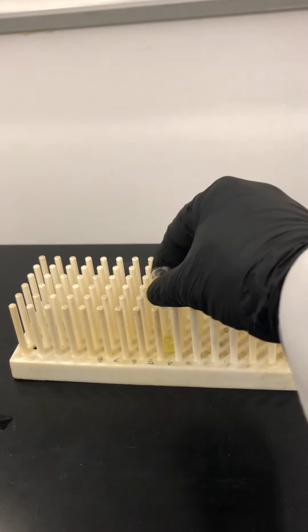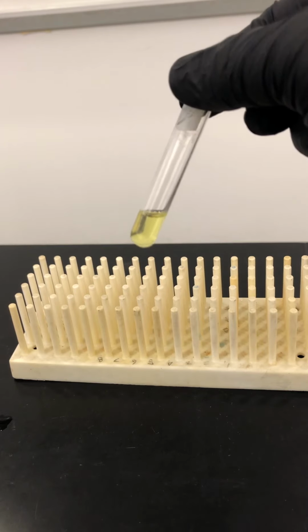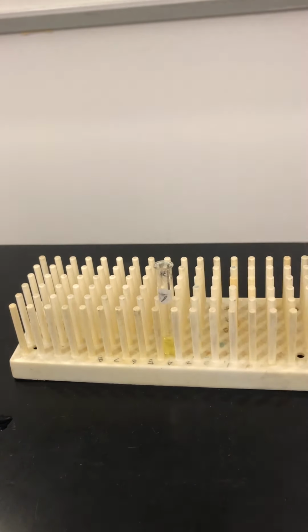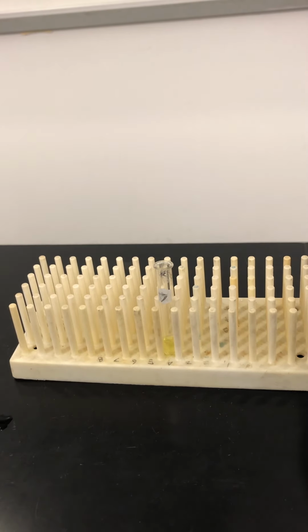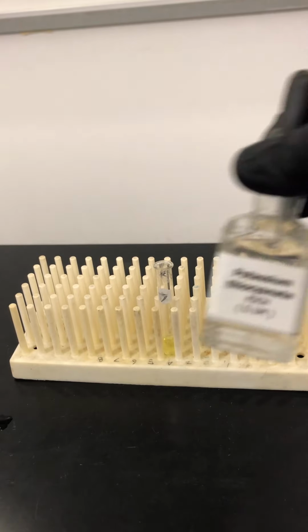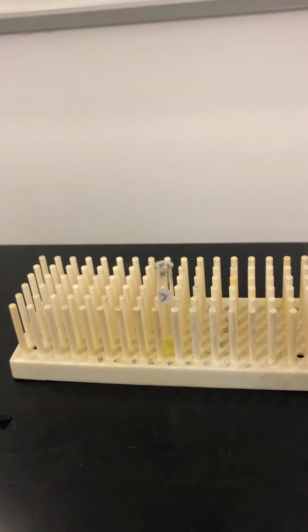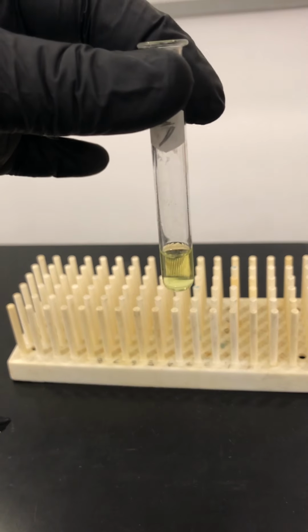Okay, students, I'm back on the bench here. This is my redissolved iron sulfide precipitate. It is now iron ions in solution. And once more, we're going to take advantage of a chemical property that many of these transition metal cations have, which is the ability to form complex ions of interesting properties. In this case, we're going to use potassium thiocyanate, and we will see this reaction in other labs. But essentially, all I'm going to do is throw in about 3 drops of this.